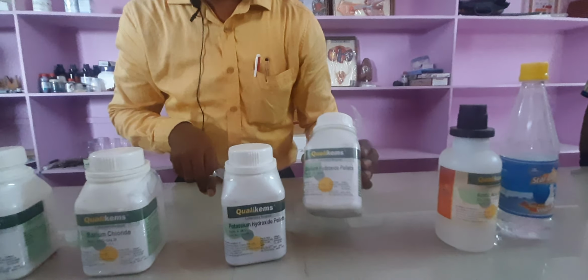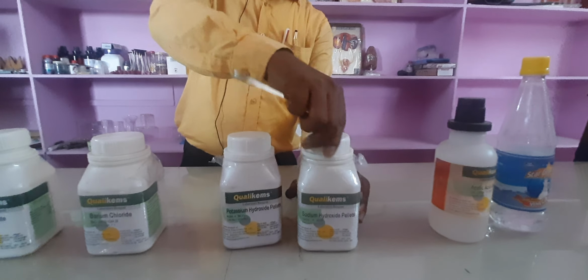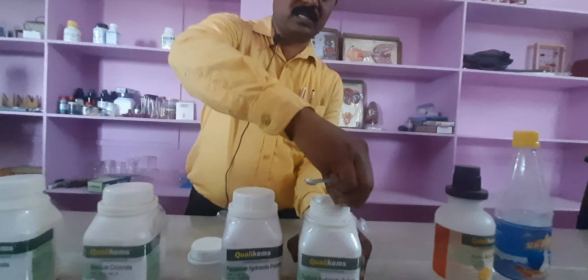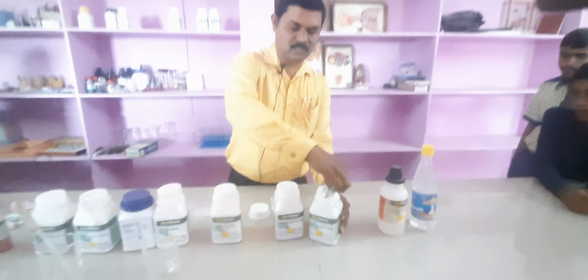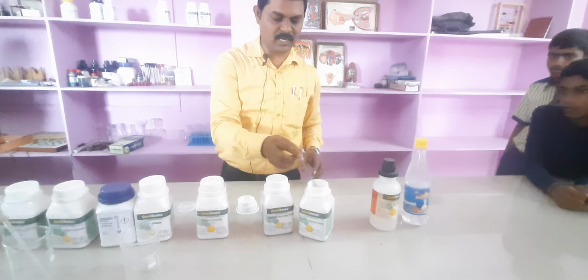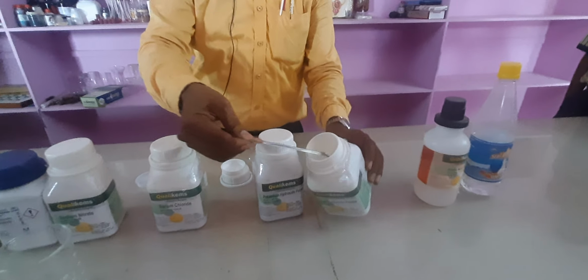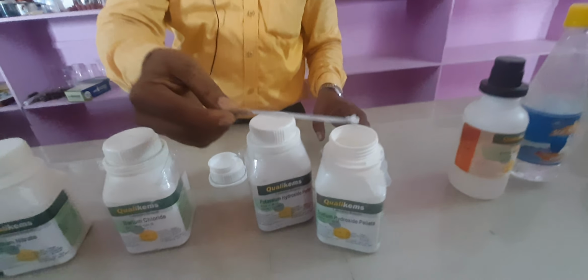And this is one of the basic substances, sodium hydroxide. So sodium hydroxide is a base. We should not touch these bases directly with bare hands because some bases are corrosive. So let us see how this base looks. I want to show one of the sodium hydroxide pellets. They are just white crystals, sodium hydroxide pellets.